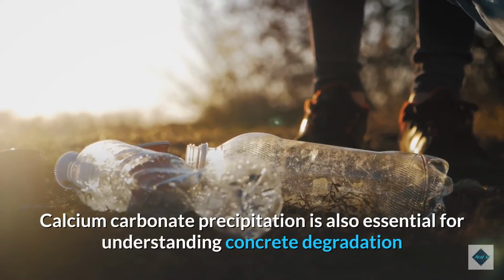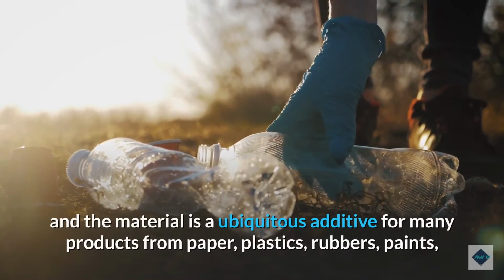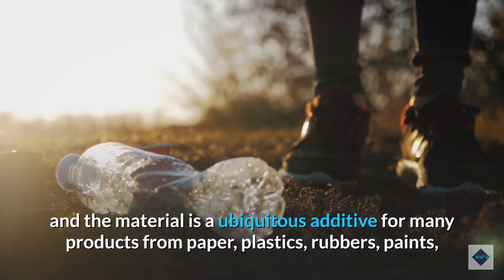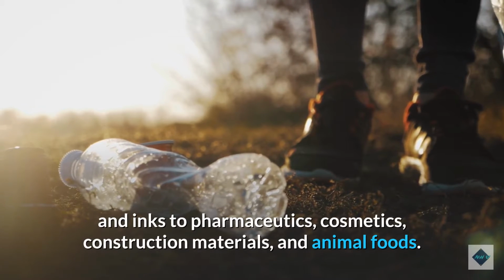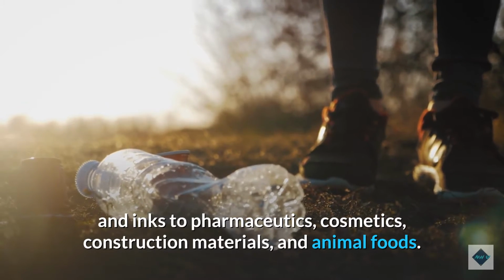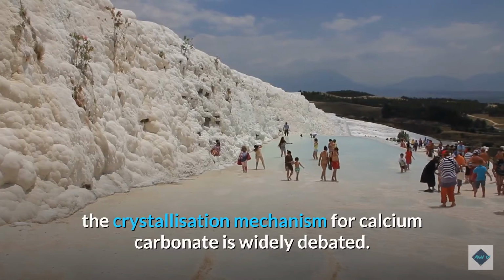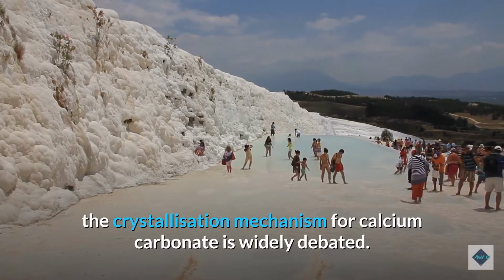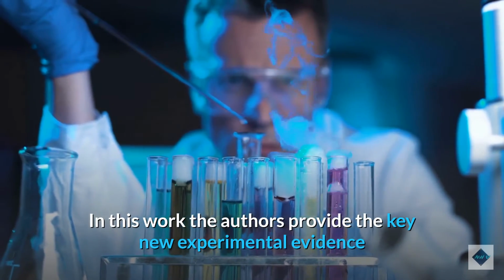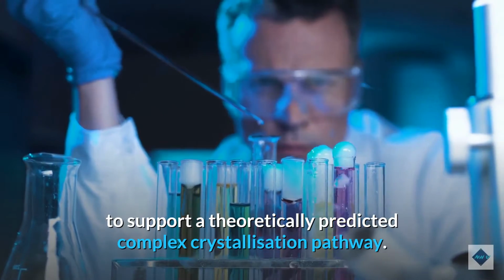Calcium carbonate precipitation is also essential for understanding concrete degradation, and the material is a ubiquitous additive for many products, from paper, plastics, rubbers, paints, and inks to pharmaceutics, cosmetics, construction materials, and animal foods. Nonetheless, despite this widespread use, the crystallization mechanism for calcium carbonate is widely debated. In this work, the authors provide the key new experimental evidence to support a theoretically predicted complex crystallization pathway.